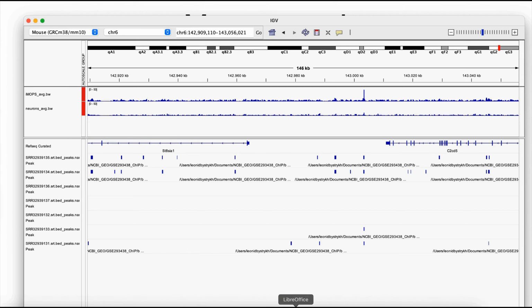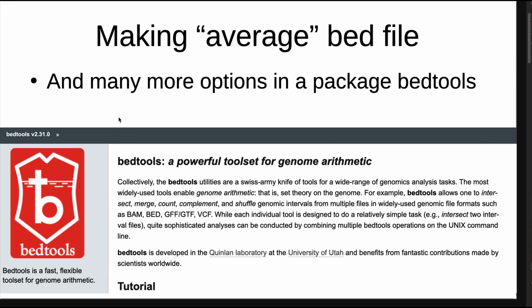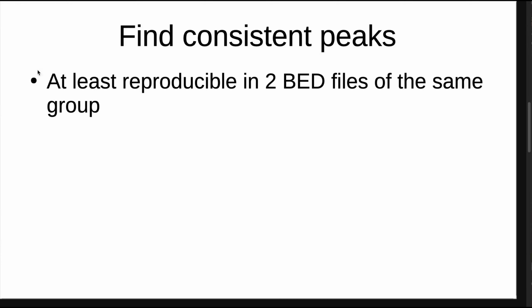And whereas in the case of BAM files you use deepTools, in the case of bed files you will switch to Bedtools, and it will help you make average files. However, speaking of average, don't take it literally. More likely we will want to have consistent peaks.